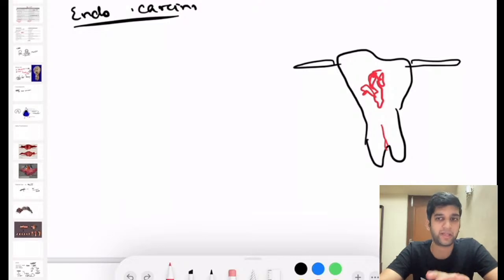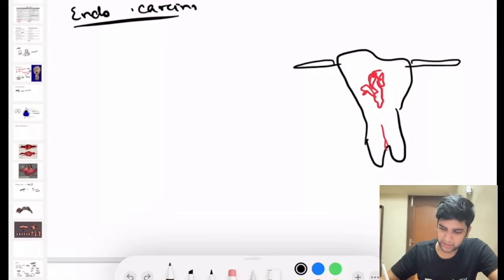Okay, you cut open the uterine cavity, you cut here transversely looking at both your fallopian tube and your ovaries, fine. So what all specimens, what all bits do you give? What all bits are required? If you have given bits, I'm sure you must have given bits for this. I need 2 bits from cervix.